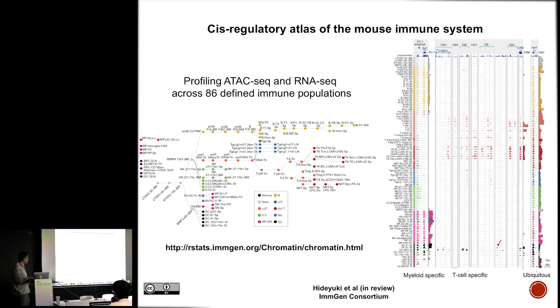So we can start from stem cell populations through DC, macrophage, and granulocyte, derived from hematopoietic stem cells, but then there are also some macrophages from microglia, the red pulp, and the lungs. You can see the ILCs, NK cells, and really one of the nice features of this data set is that we can actually look at differentiation series. So this is T-cell differentiation, this is B-cell differentiation, and we capture the entire differentiation series. So this is a really nice data set.